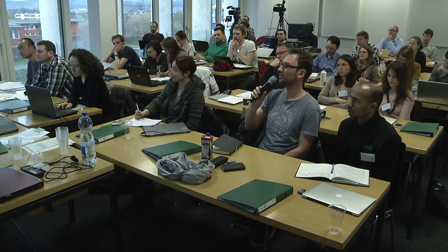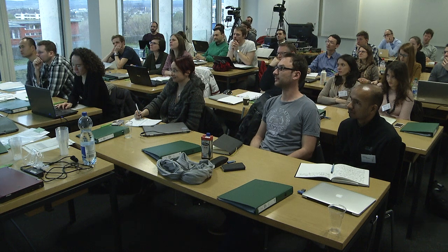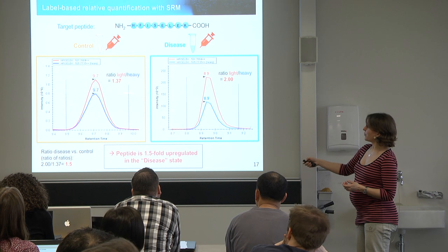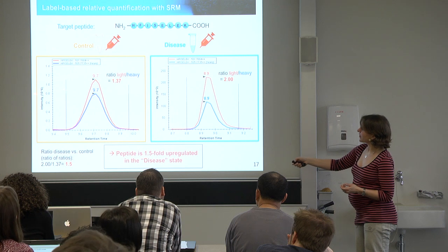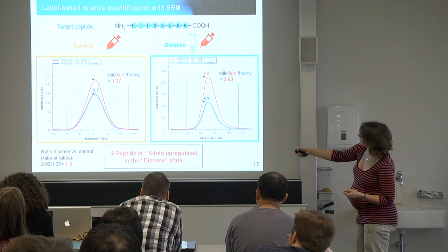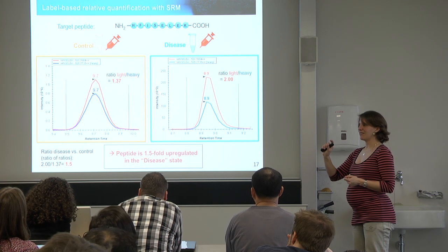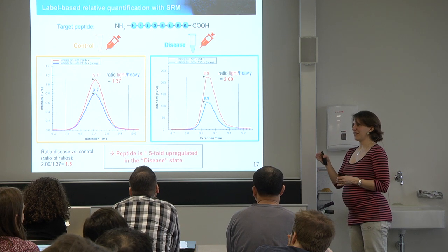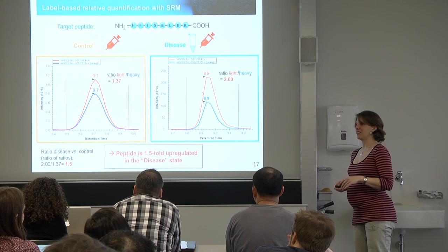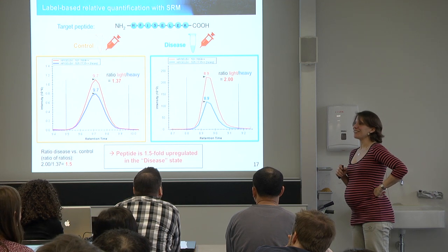The y-axis is very different. So this is a fake picture. You're absolutely right. It's a very good point, because in theory what you would expect is that the intensity, because they are both spiked the same way, should be similar. So here we have an intensity of 0.8 e to the 6, and here it's 150 e to the 3. And if these were 2 measurements taken directly after each other on the same instrument, that would be a huge variation. So it would be very bad.